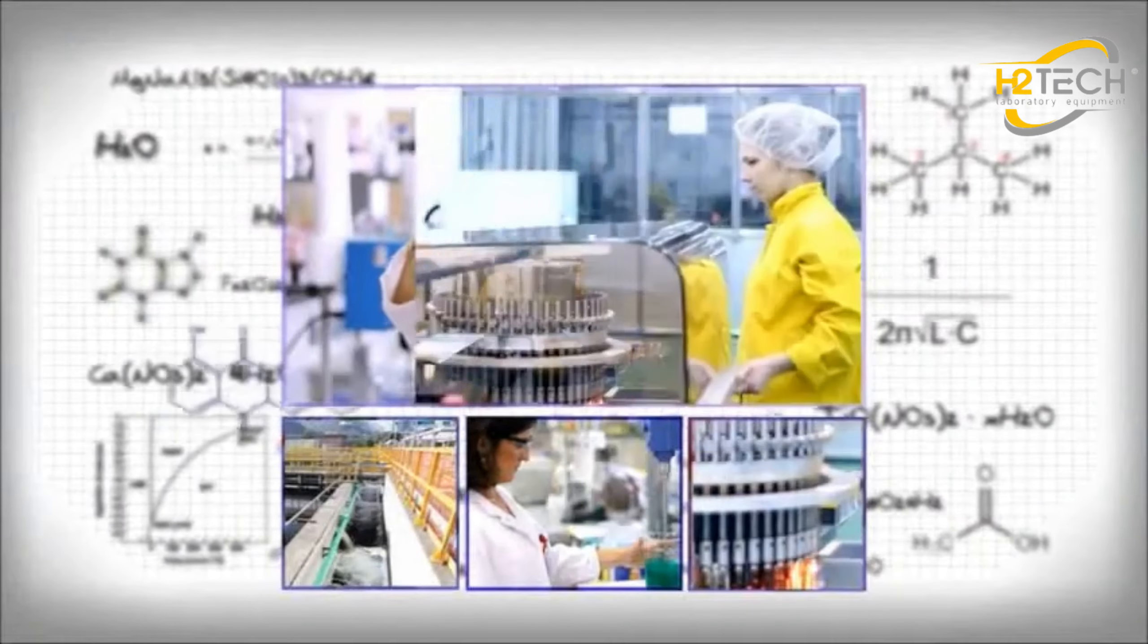When you need to quickly and precisely determine moisture content in food, wastewater, industrial or laboratory applications, rely on A&D moisture analyzers.